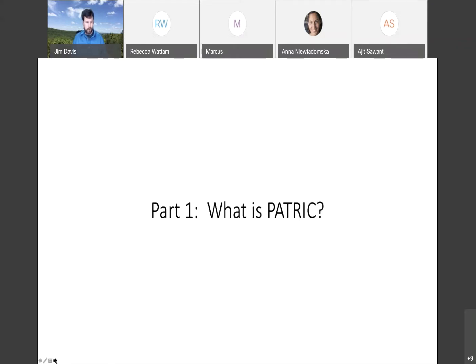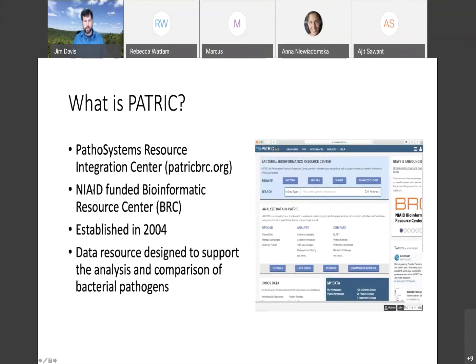So part one, what is PATRIC? PATRIC stands for Pathosystems Resource Integration Center, and our URL is patricbrc.org. This is what it looks like whenever you come to the homepage. Can you guys see my cursor?